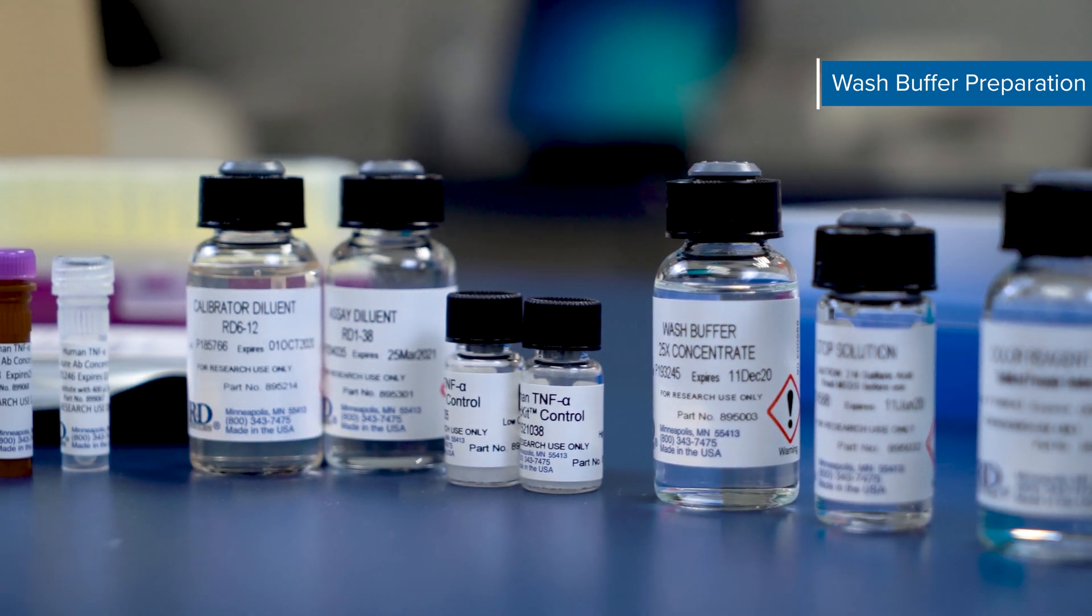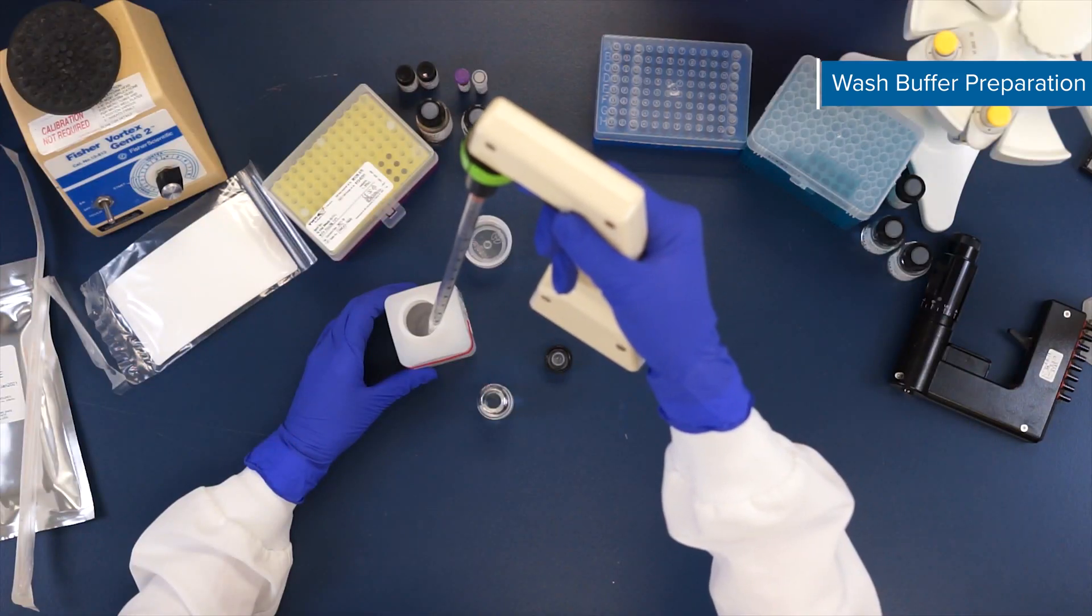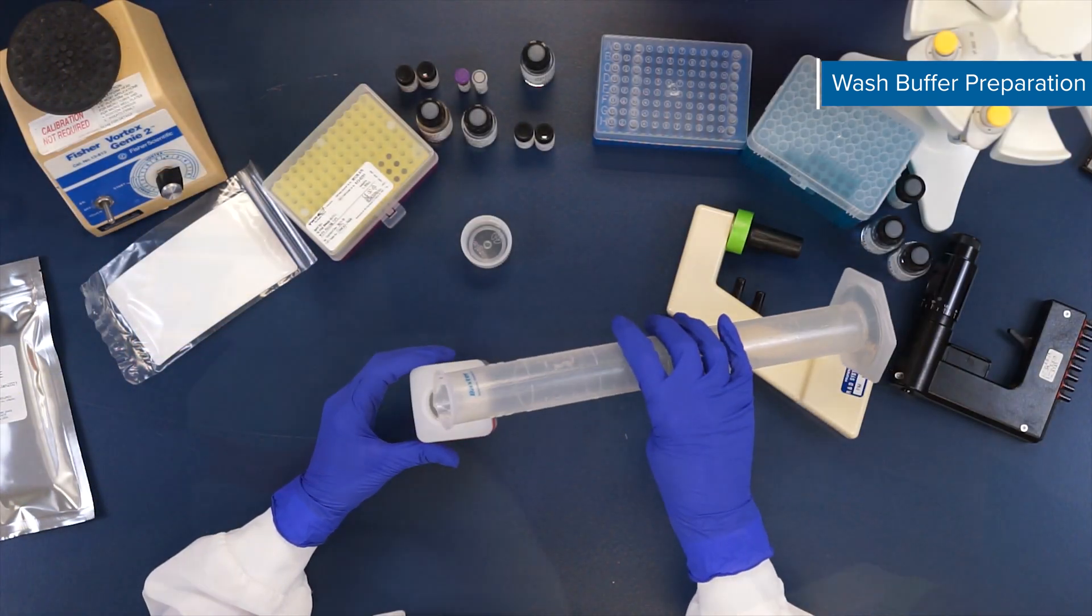To prepare your wash buffer, add 10 mL of wash buffer concentrate to 240 mL of deionized or distilled water in a graduated cylinder to yield 250 mL of wash buffer. Mix gently.